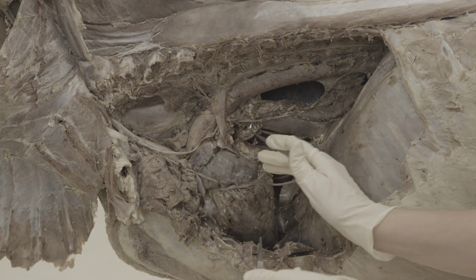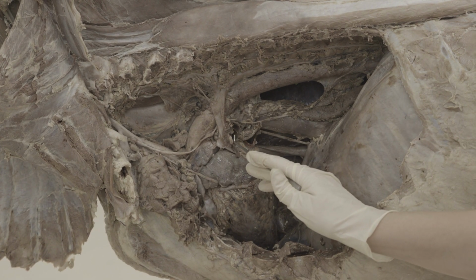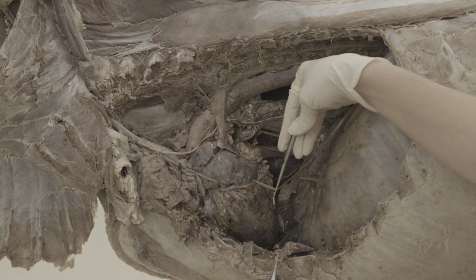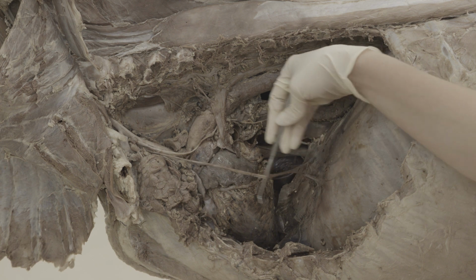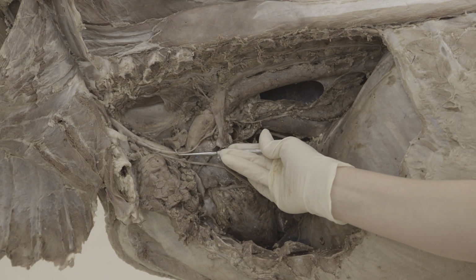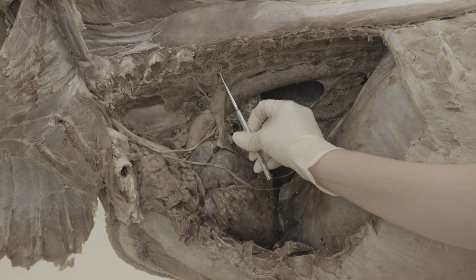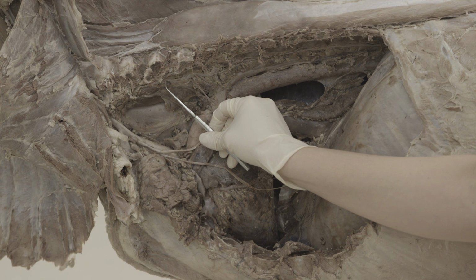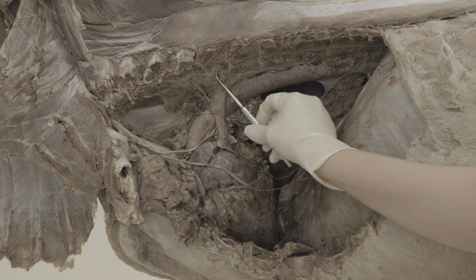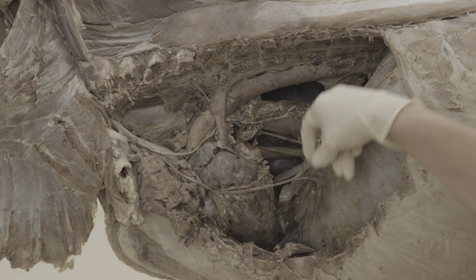Then our vagus nerve will continue caudally, and then it will branch into those dorsal and ventral branches. But before we do that, I just want to point out that the phrenic nerve here is right next to that vagus nerve. So you have phrenic nerve, then you have vagus nerve right here. And then as long as we're pointing out nerves, I'll point out the sympathetic trunk. So sympathetic trunk is that one along the spine here. So sympathetic trunk up here, and then you have vagus nerve and phrenic nerve.